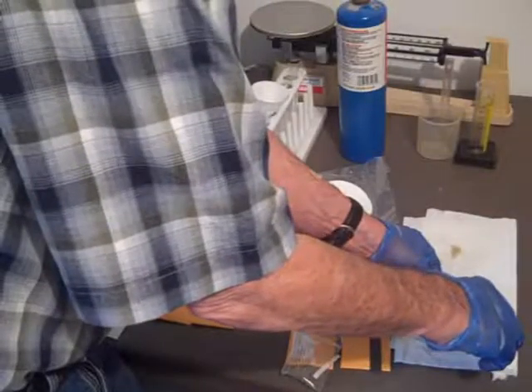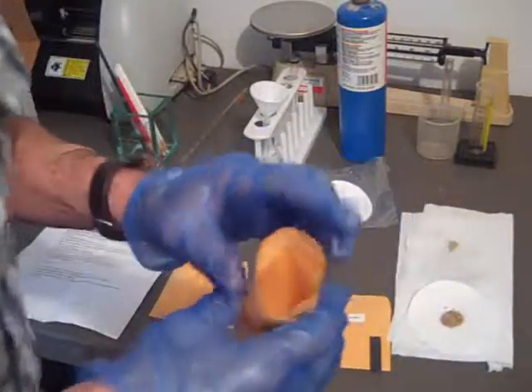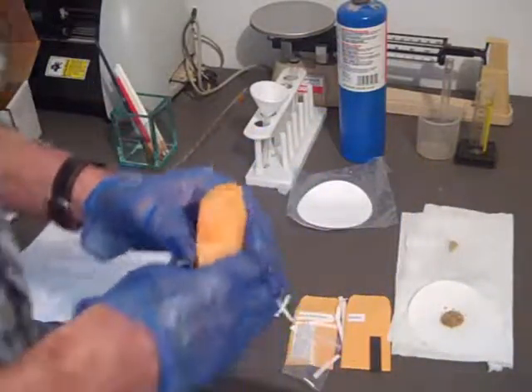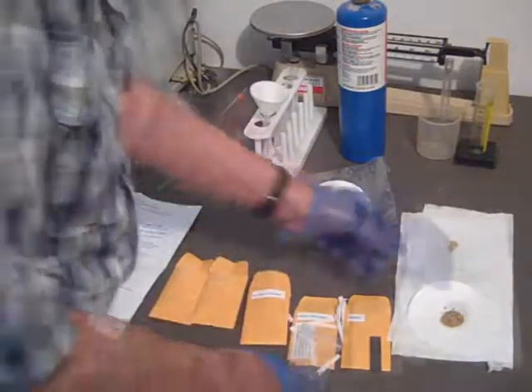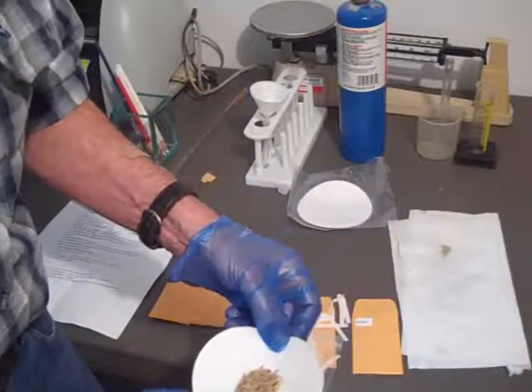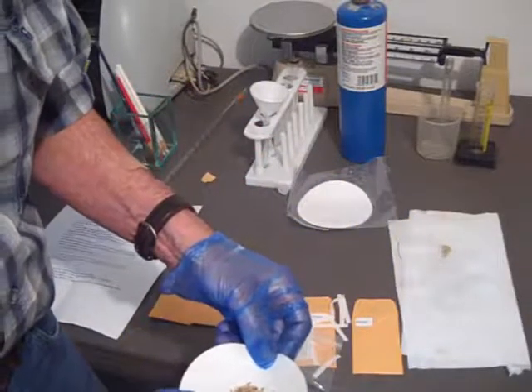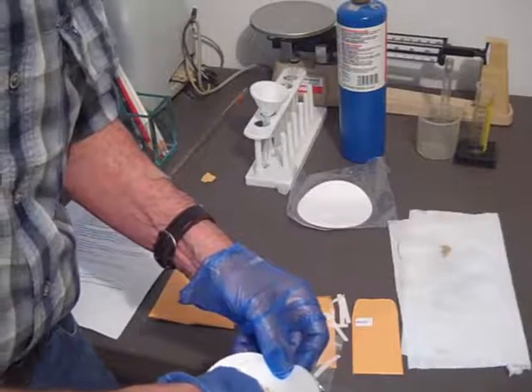We've just poured the iron filing, salt, and sand mixture onto a piece of filter paper. This is part B because it contains all the important elements of our experiment. Here we're taking the magnet and running it through the mixture of the iron filings and the salt and the sand.